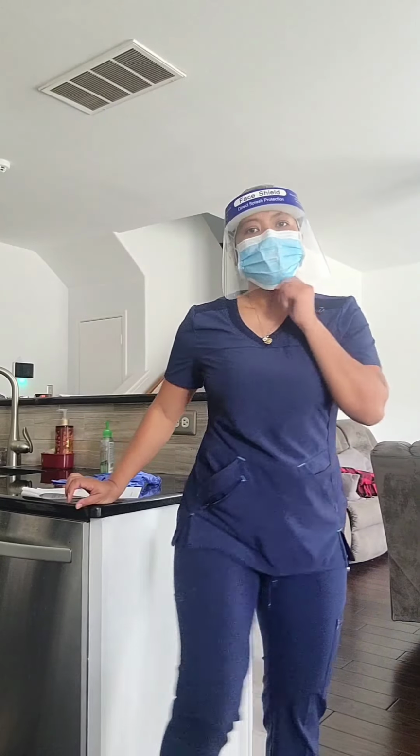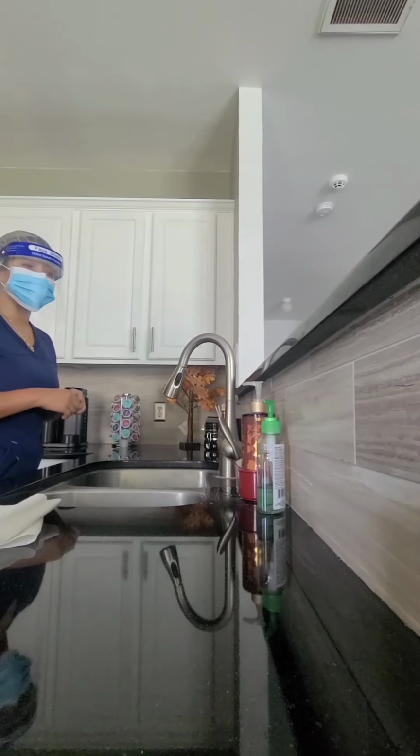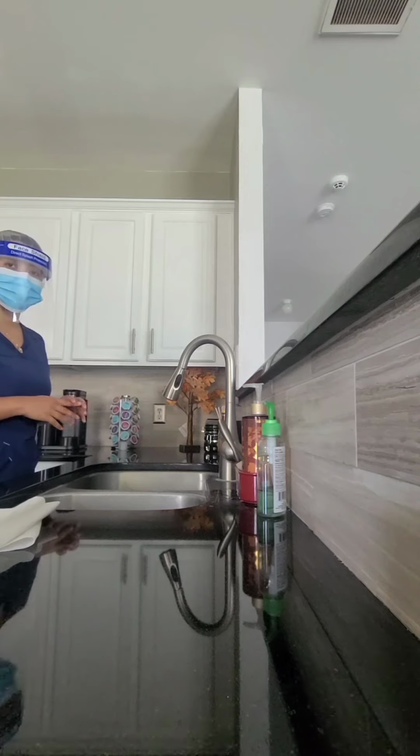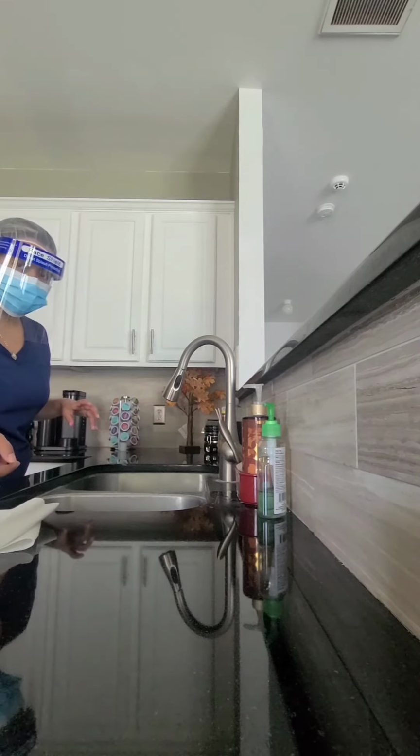All right, now that I have my shoe covers on, my face mask and my hair cover on and the face shield, I'm going to perform the aseptic hand washing technique. Okay, the first thing I'm going to do is to make sure I have all the stuff I need next to me, like the hand soap, the nail brush, and paper towels.